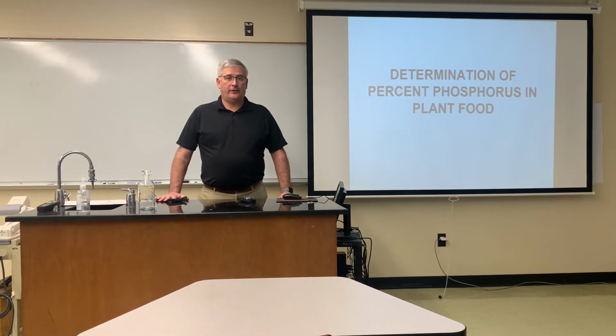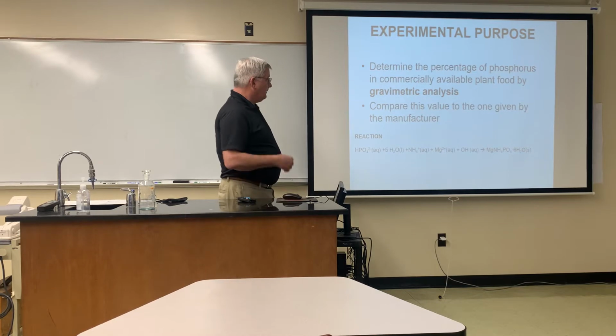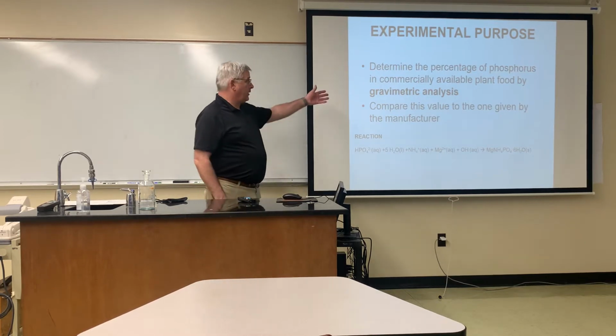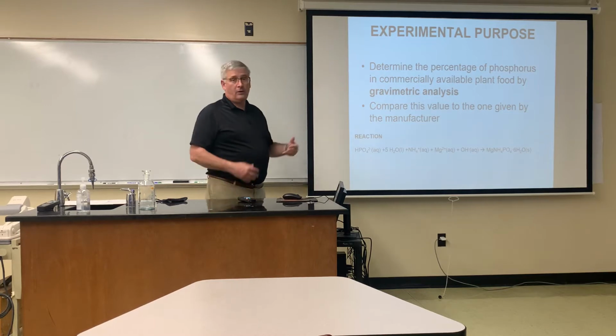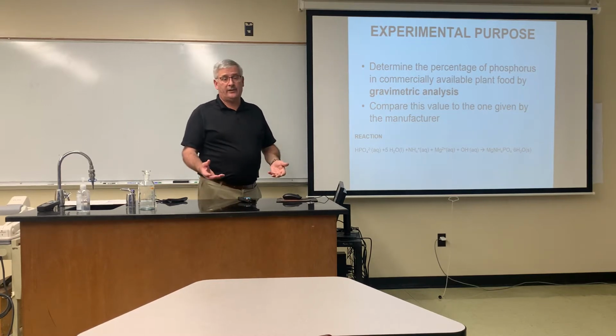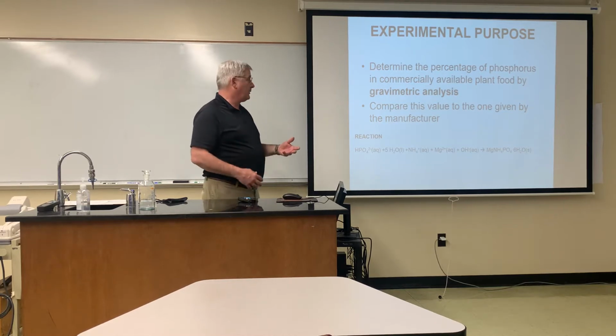This week we're going to do the determination of phosphorus in plant fertilizer by gravimetric analysis. In commercially made products that contain phosphorus for fertilizer, there are ways that we can check to make sure that the advertised value is the same as what's actually present.